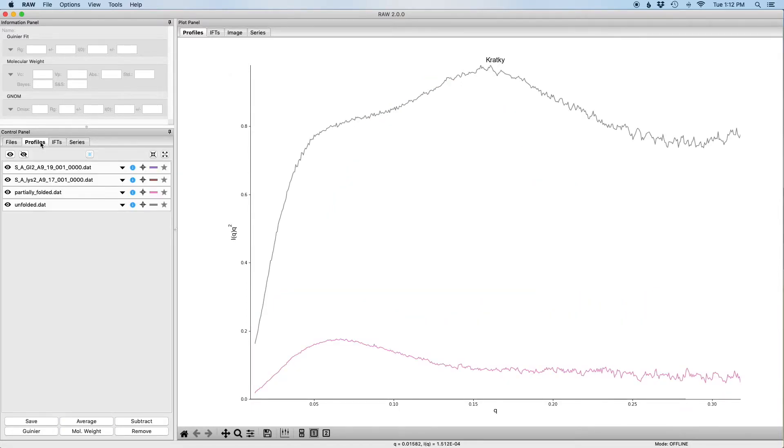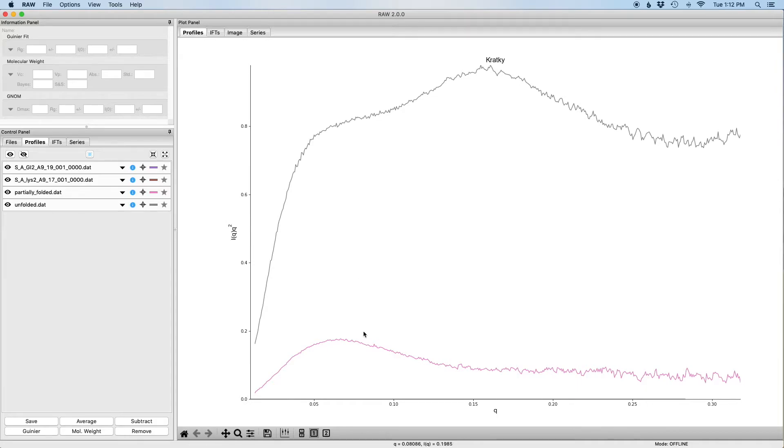So if I go back to the profiles tab in the control panel, you can now see that all four profiles are loaded. However, on the plot we're really only seeing two profiles: the unfolded and the partially folded.